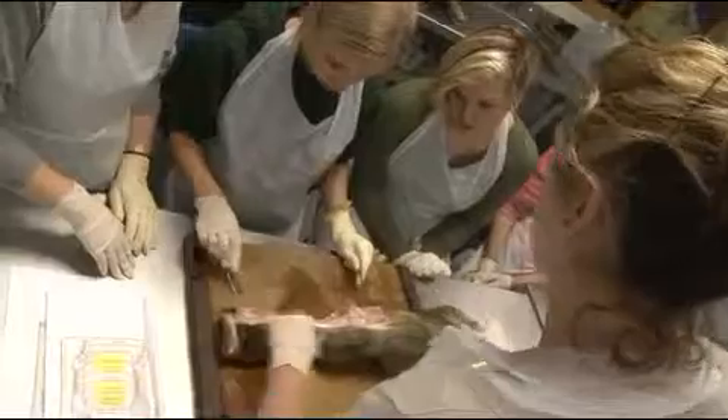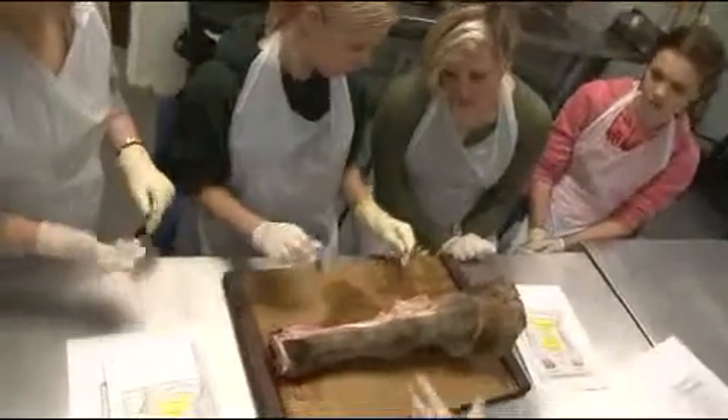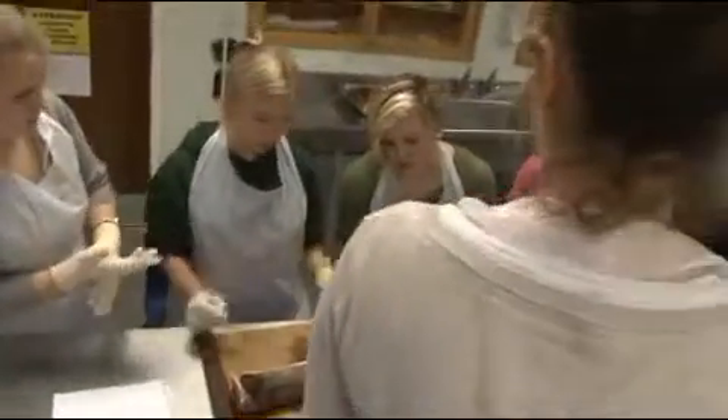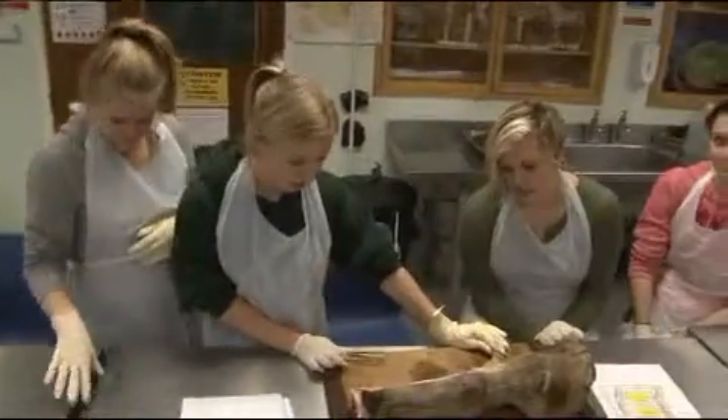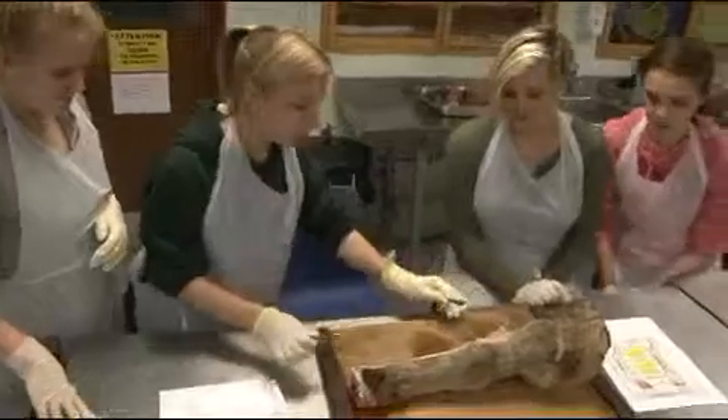You've done really well. If you turn it round and come around this way, then you can do this side. Does anyone else want to have a bit of skinning? It doesn't smell at all.